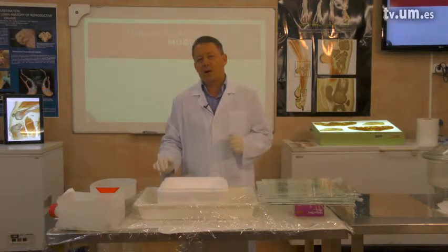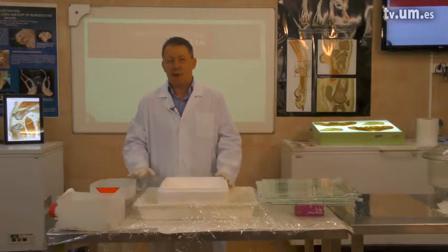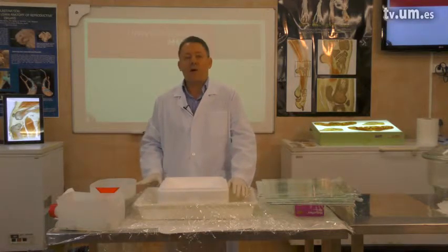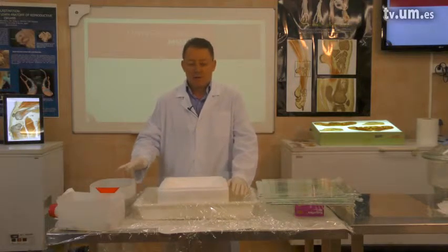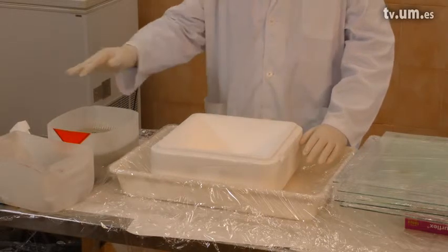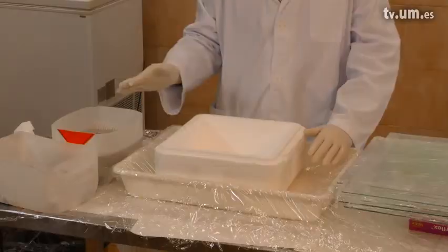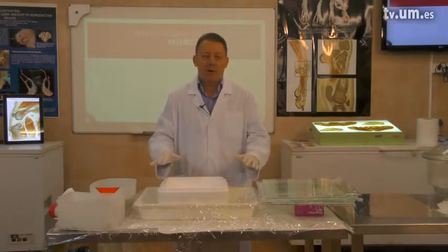We remove our resin butt out of the vacuum chamber and place it nearby where we will cast. One thing to be aware of: epoxy mixture is like a glue, so if you drop some epoxy around, it will stick after one day.